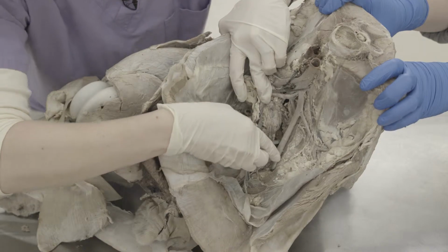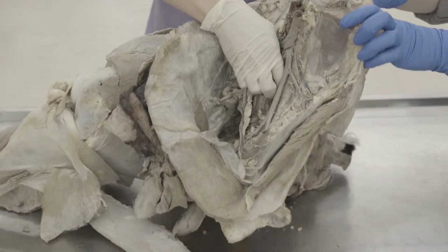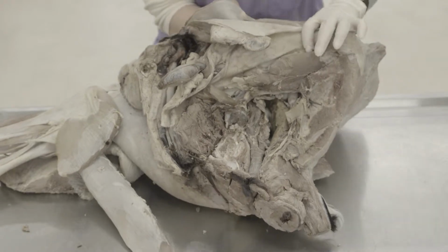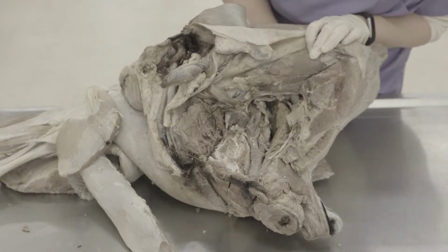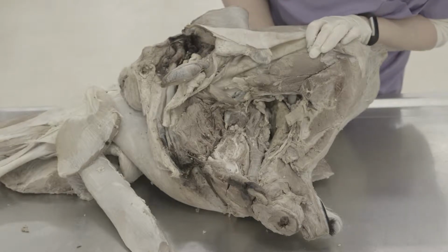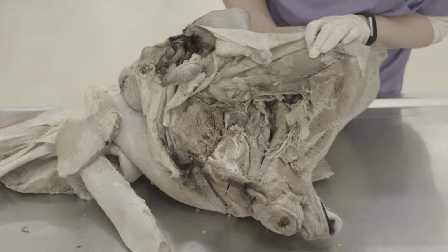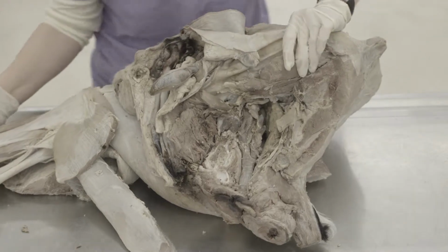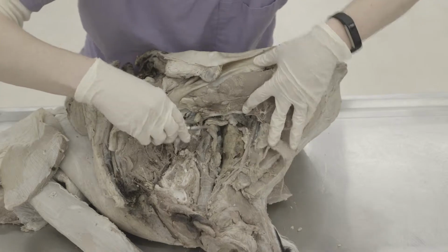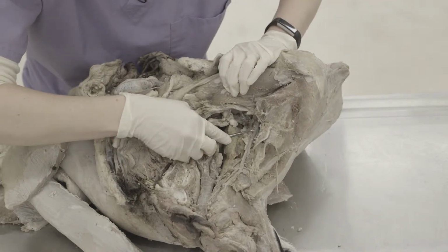And I'm actually just going to stick the probe through, and then we're going to turn it to the lateral side, and you can see where the probe is coming out. That's where that cranial gluteal artery is coming through. So that's coming out of the greater sciatic foramen with that sciatic nerve there. So cranial gluteal artery here, and then on this side we're going to continue to follow the internal iliac right here.